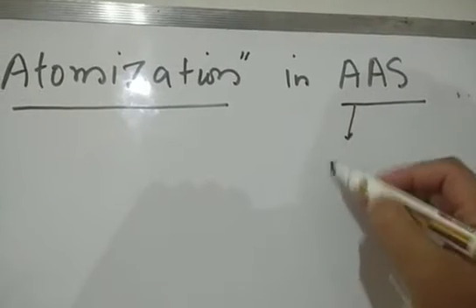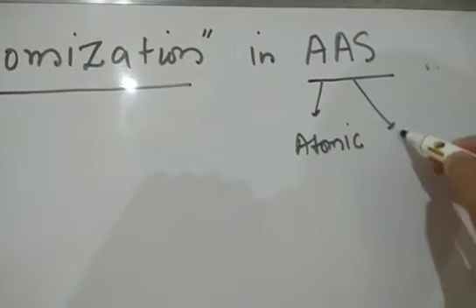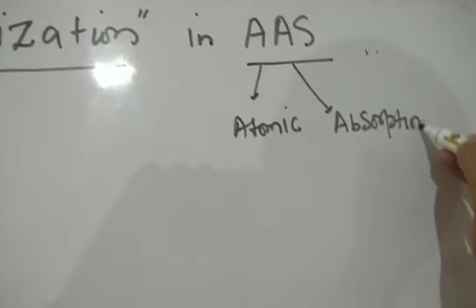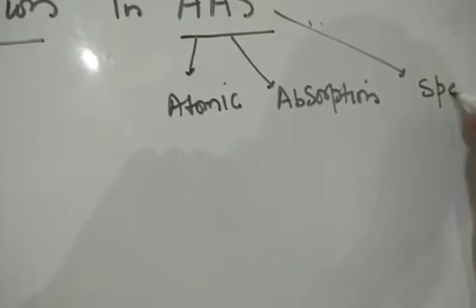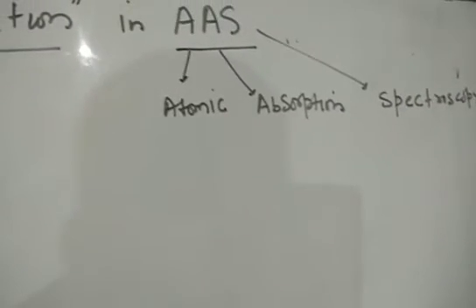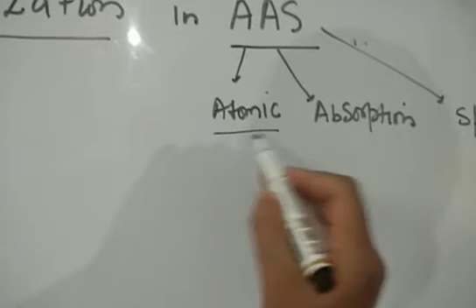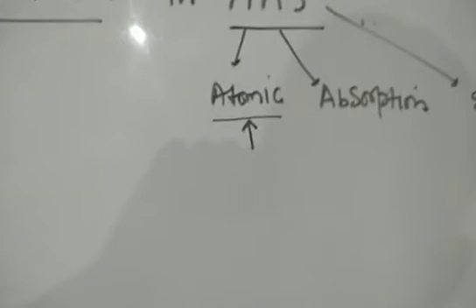So this is atomic absorption spectroscopy. पिछले लेक्चर में मैंने थोड़ा सा एक डिफरेंस दिखाया था between the molecular spectroscopy and atomic spectroscopy. Now this is atomic absorption spectroscopy. यहाँ पे we are basically dealing with the atoms, purely with the atoms, not molecules. That's why it's called atomic.